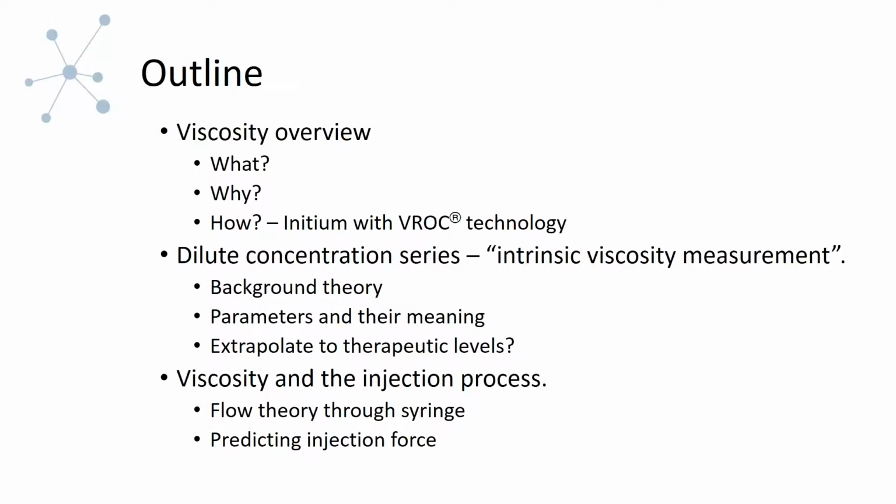Okay, so just a quick outline about what we're going to go over today. Just in case you're not fully familiar with viscosity, we're just going to have an overview here. So what is viscosity? How is it defined? Why is it a crucial parameter to measure? So why should you care about it? And then how can we measure the viscosity of your samples?